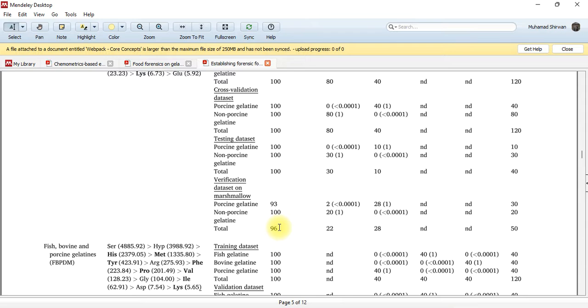So this is the challenge of laboratory testing. In actual pure palm oil, for example, you will get 100%. But when you make it into cosmetics, butter, gelatin, any margarine using some palm oil, you will get a reduced value in actual samples. So this is the confirmation of how good your discriminating model is, how good you are at explaining it, but you still might face challenges in actual samples. So take note of that.